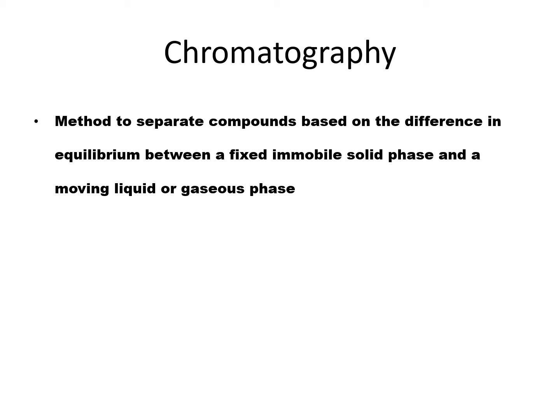So when I say the affinity of the compounds or the solid sample to the stationary phase and mobile phase, it has to do with the polarity of that compound with respect to the stationary phase or the mobile phase.